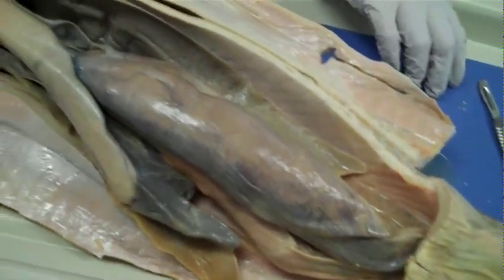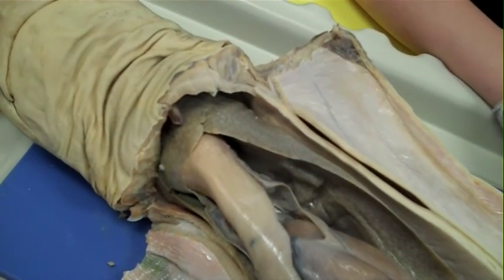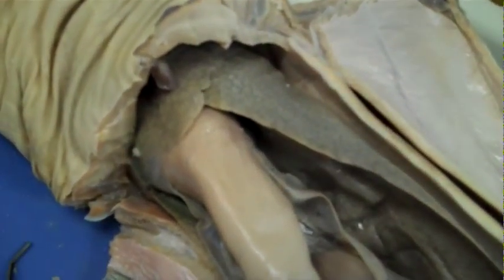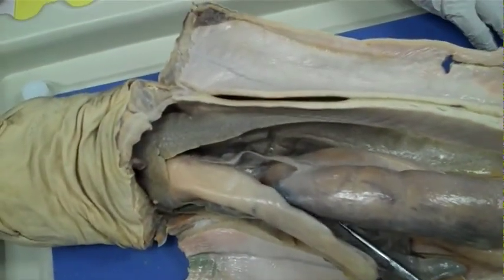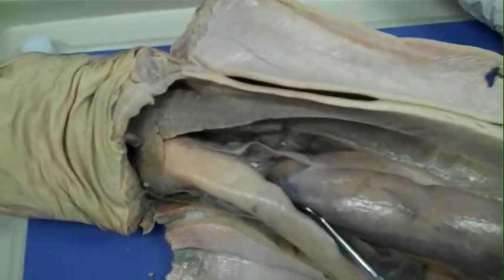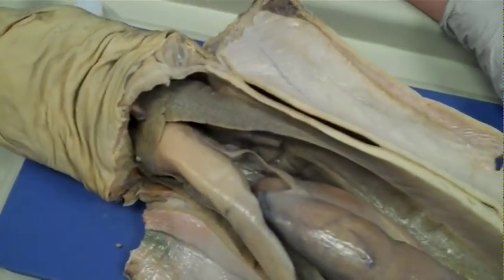It is not just for processing stuff internally, but also it is its flotation device. The liver is filled with oils, which is what keeps the shark from sinking. Think about it — it does not have an air bladder like most fish do, so it has these huge livers. In this case, their livers are at least 20% of their internal anatomy, if not more.